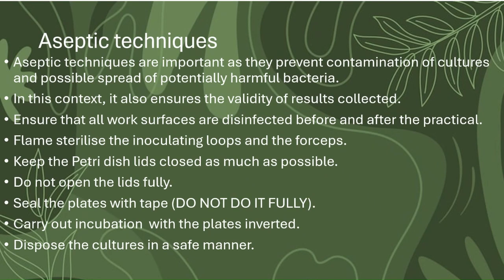So aseptic techniques are important as they prevent contamination of cultures and possible spread of potentially harmful bacteria. And it is really important you know this slide because past papers on this particular topic are literally there every single year. So just remember this one. In this context, it also ensures the validity of results collected.